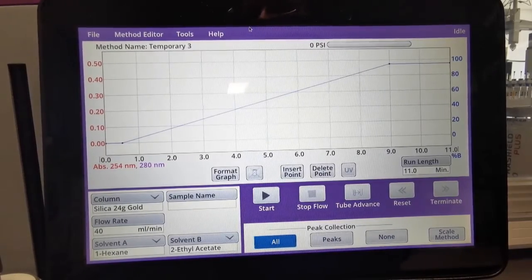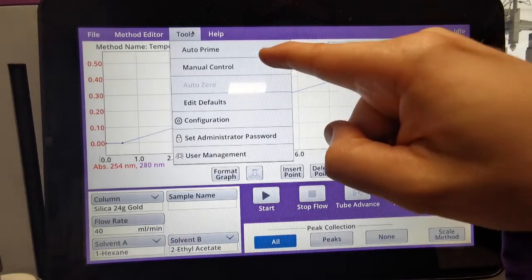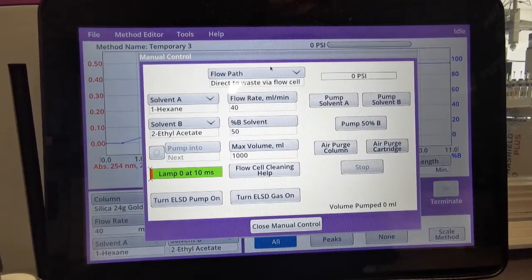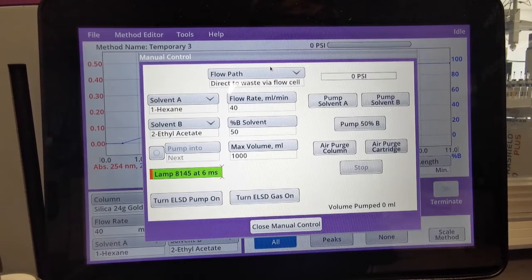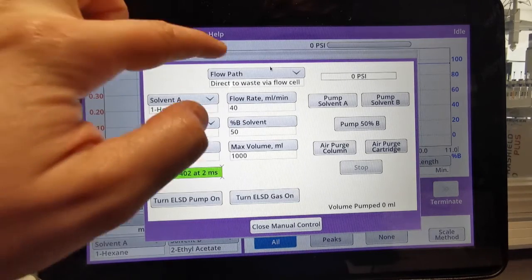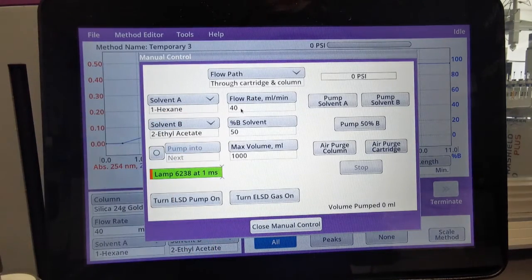If we are moving from normal phase to reverse phase, we need to flush the system with a miscible solvent such as IPA. In order to flush the system, we go into Tools and we select Manual Control. As you can see from this table, we have quite a lot of options that we can choose from. What's important to note is the flow path, and this directs where the IPA will run through. In order to flush the system fully, we choose through cartridge and column.